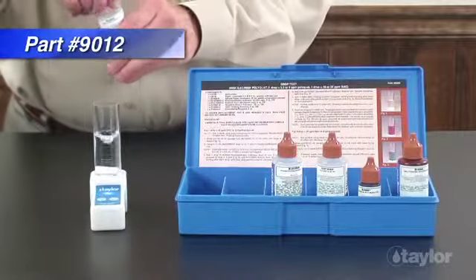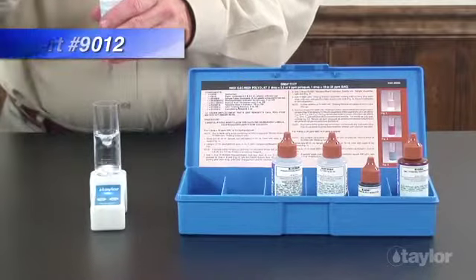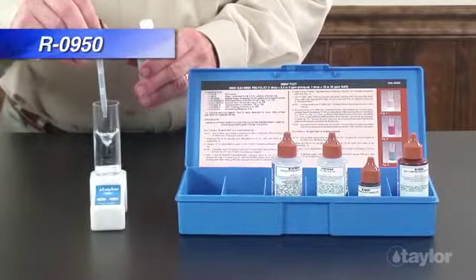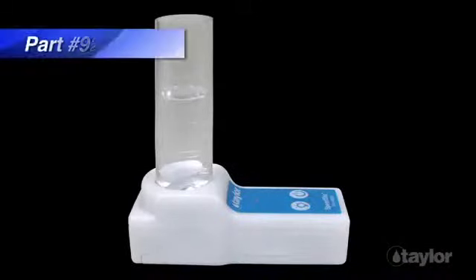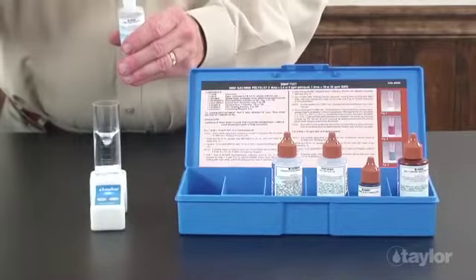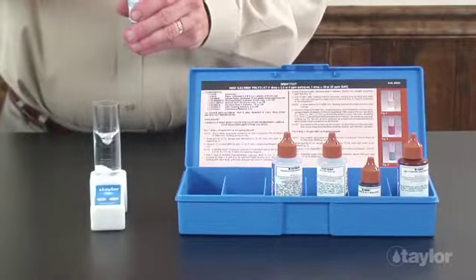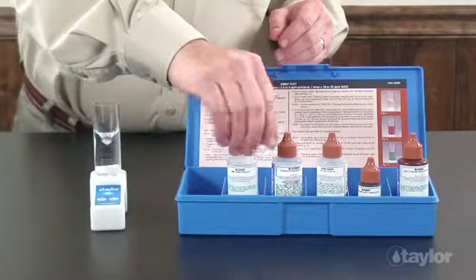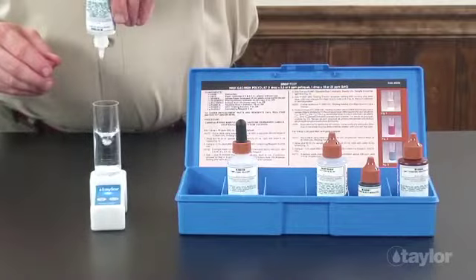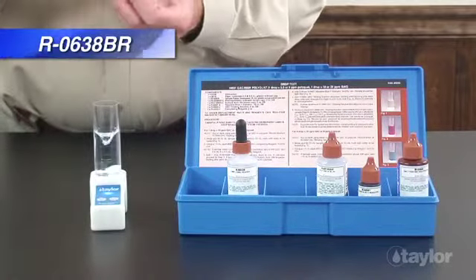Using a 1 milliliter pipette, add 1 milliliter of complexing reagent. Swirl to mix. For this demonstration, we're using Taylor's Speed Stir, which is sold separately, but you can also manually swirl the sample. Note, if the sample water contains a hardness concentration above 500 parts per million, add 2 milliliters of complexing reagent. Holding the bottle vertically, add 1 drop of phenolphthalein indicator.